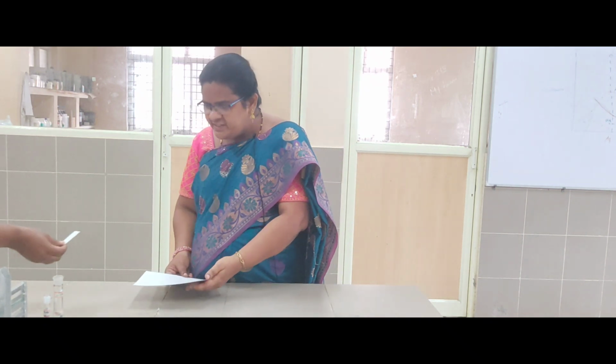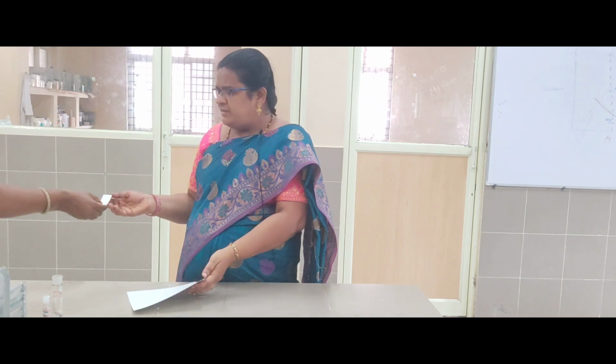We have to cut these TLC plates into 10 cm by 10 cm, or 10 by 5 cm, or 20 by 20 cm. First, using scissors we can cut the TLC plate. This much of a small plate is enough, as it is a laboratory practical, a small scale practical.